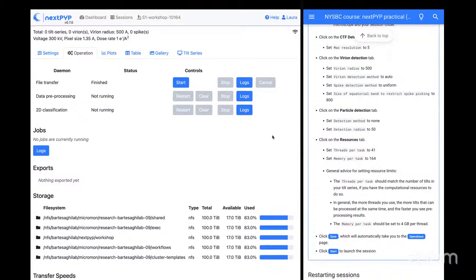so under the hood, what is happening in the sessions is, when you're acquiring data, you can in theory be there for anywhere from 30 minutes to 5 days. Within that time, you don't want your data acquisition to stop before you're actually done gathering your data. The way that we keep this continual job running, and you can define how long you want your job to run based on how long you expect to be sitting at the microscope, is through these first 2 daemons for tomography. A daemon is just a long running job. You can think of it that way. The first 2 are going to be used in tomography.